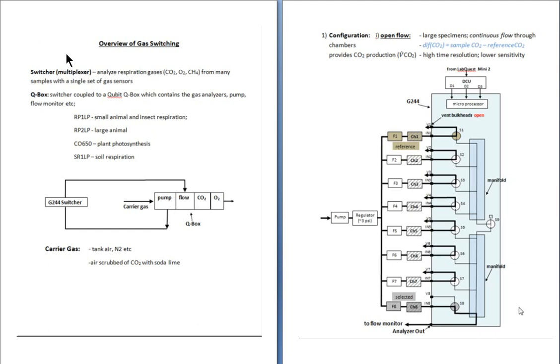I'm part of the Qubit team that designed the software for the gas switching apparatus. There are three other videos in addition to this overview video, and these other videos discuss various aspects of the switcher, some of the concepts of switching, the features of the Logger Pro software which runs the switcher, and finally there's an assembly video produced by Monika Kuzma in which she discusses how the apparatus is assembled.